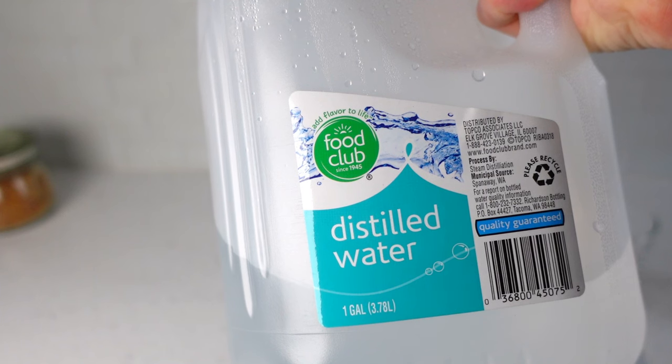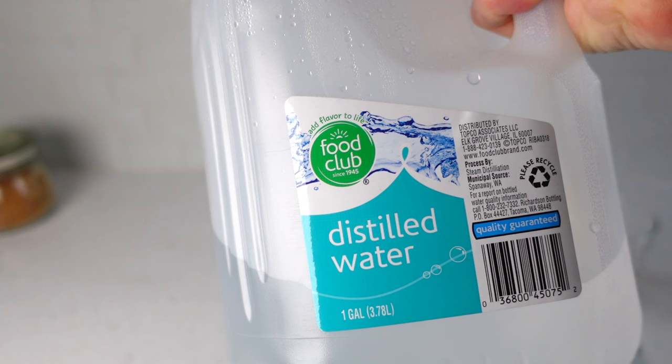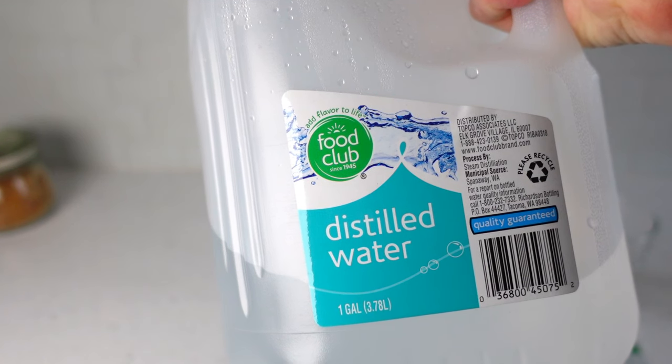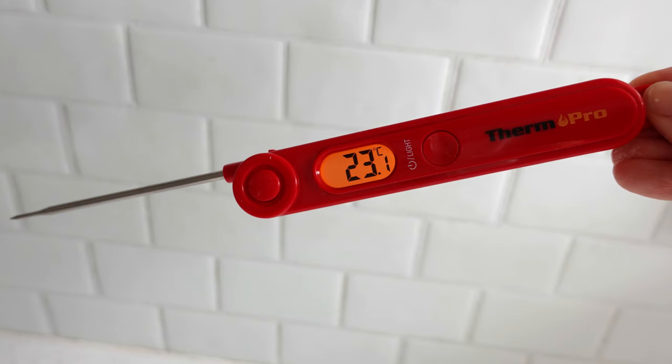Tap and well waters vary in their chemical and mineral profiles, whereas distilled water ensures purity and a consistent standing pH needed for accurate calibration. A digital thermometer isn't required, but it's very helpful in getting the distilled water to the correct temperature, again for an accurate calibration.